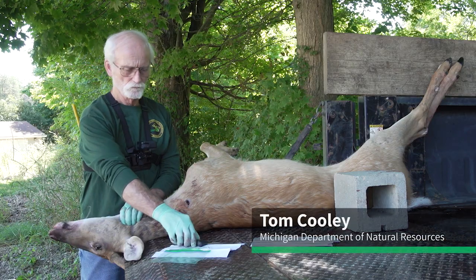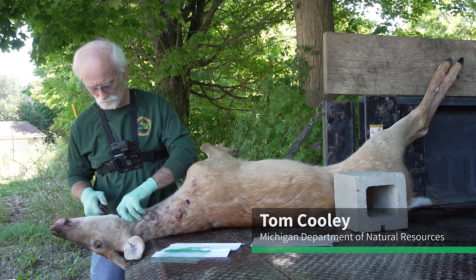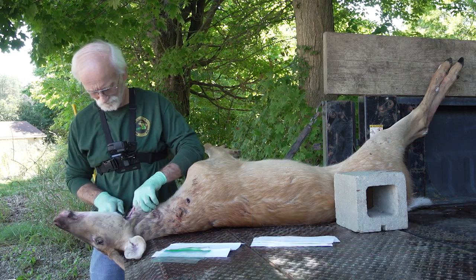Tom Cooley, DNR wildlife pathologist, will now walk you through removing the medial retropharyngeal lymph nodes from your harvested deer for CWD testing.